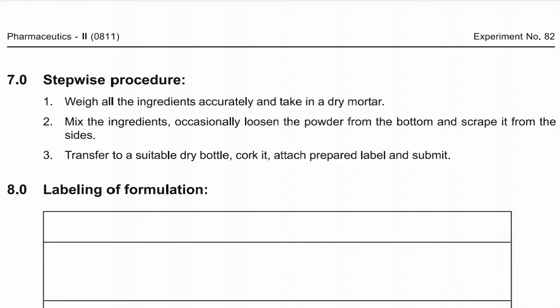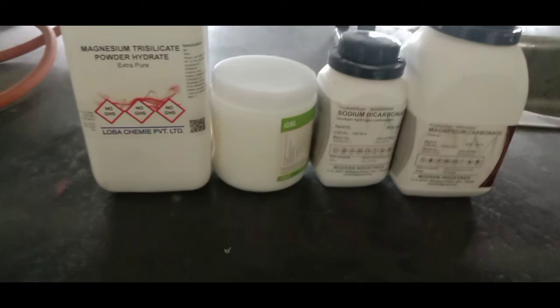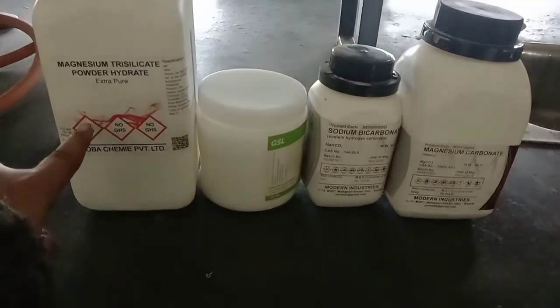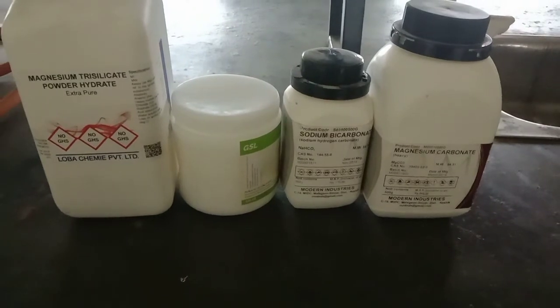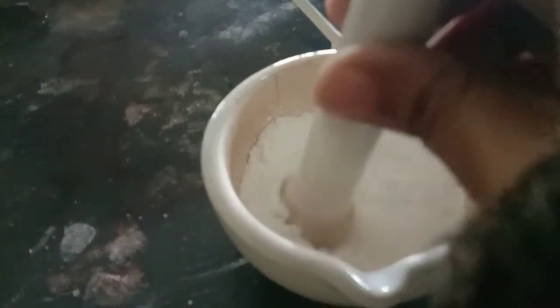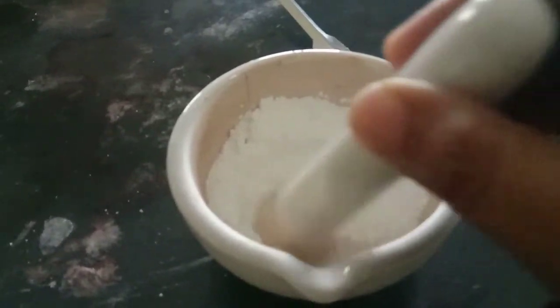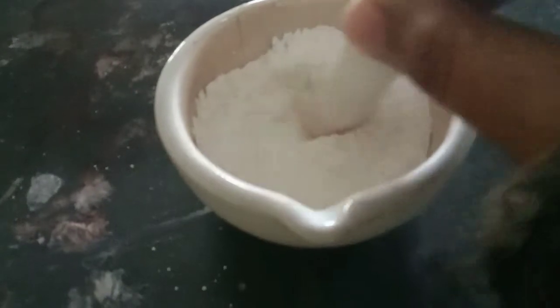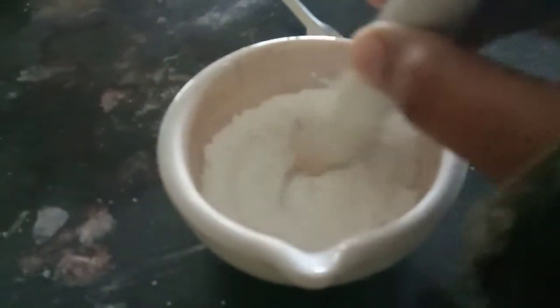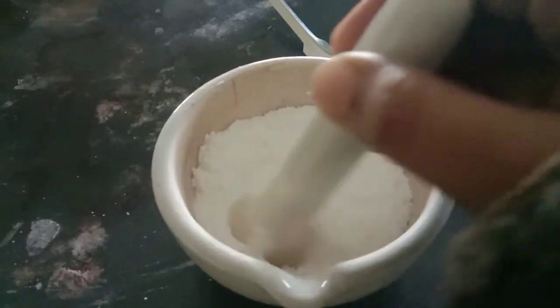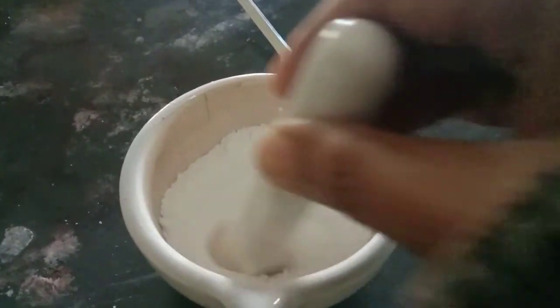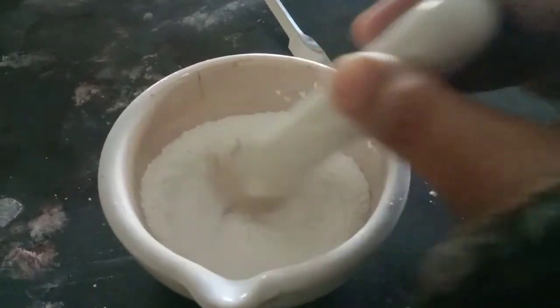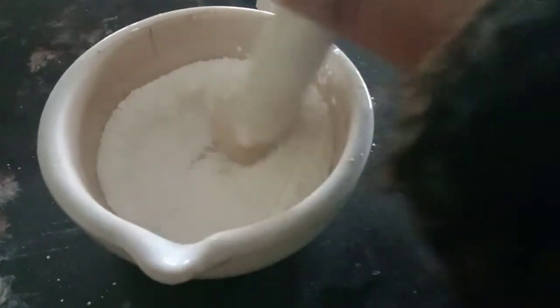So let's start. Here I have taken out the ingredients from the shelf — we have magnesium trisilicate, chalk powder, sodium bicarbonate, and heavy magnesium carbonate. We weigh the ingredients and transfer them into a mortar. Here we have weighed all the ingredients and are mixing in the mortar with a small force. We are not rubbing forcefully — we are just trying to mix it up, moving the pestle very softly so that it mixes well. Our aim is not to triturate the powder; we are just mixing it properly and carefully.